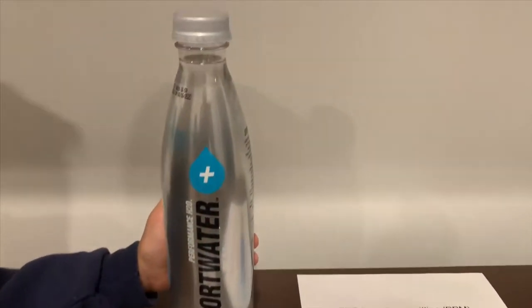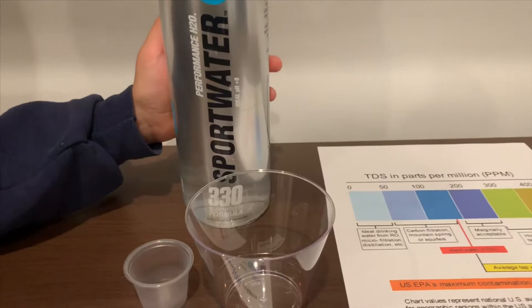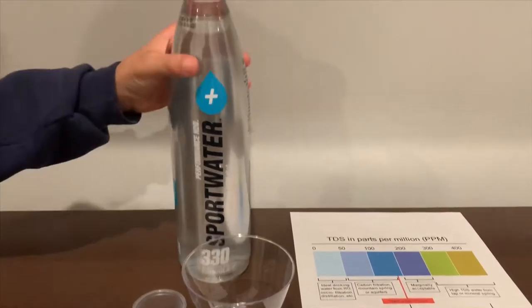This is Sport Water. It's purified with electrolytes and it costs $1.99. Let's test the pH and TDS levels.